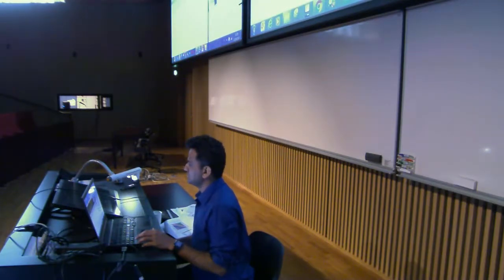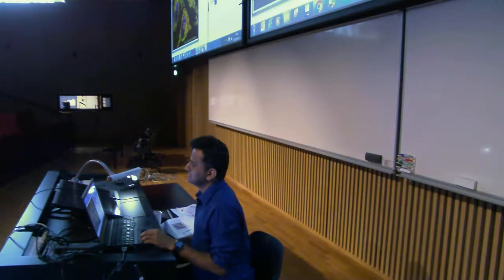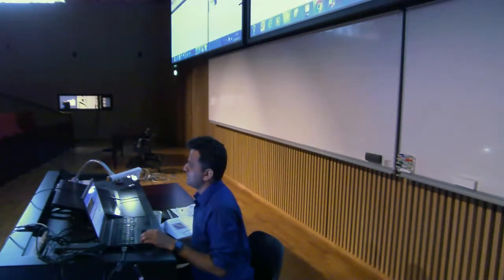You go here, more, and say AND, and now you go to analyze, because that will be highlighted. That will be an ROI there, the active ROI. Can you edit it as a new ROI? Oh, that's good. I don't think so. You want to make it actually a new ROI, right?